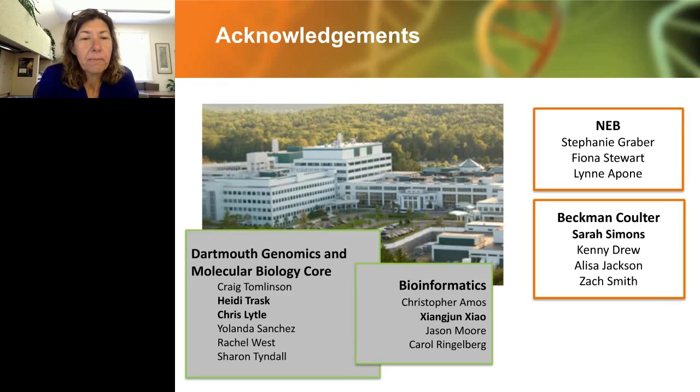So it produces random fragments. When we compare sequence coverage to targets using the fragmentation mix compared to mechanical shearing, we don't see any bias in coverage. So we believe that it is in fact random. And there have been a few independent publications looking at this issue that we're happy to send you citations for if you send us email. And I'm going to send this back to Zach.